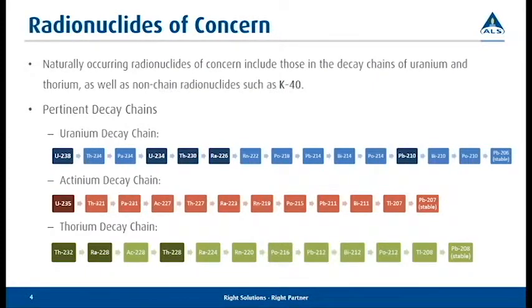Especially if you're doing stuff with gamma, many of those things, someone says, hey, I need to know what the thorium-234 is, or most of the time when you're analyzing radium-228, we're actually going to take actinium-228, which is what we're counting, and we're going to make an assumption that based on this time frame and everything, it's equal to what it is before. So the problem comes when we start doing things in TENORM, because depending on what the process is, that's where you could have broken the decay chain. So while we can do the daughter product, sometimes we can't infer back to the parent product just because the decay chain could be broken, and what you're getting based on solubility issues and everything else doesn't match up correctly anymore from what it would be in a natural environment.